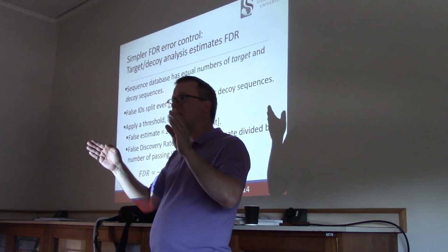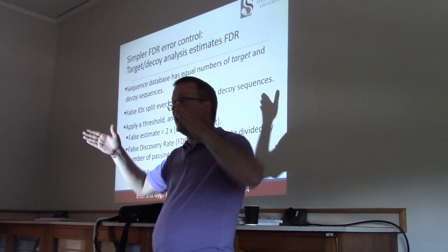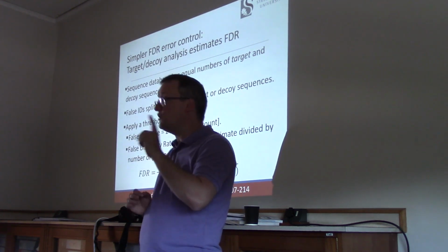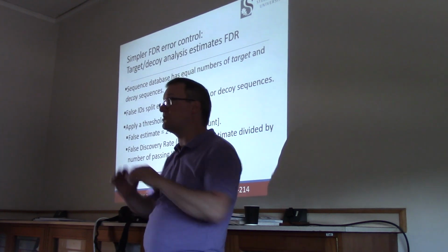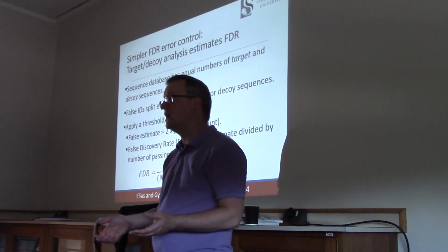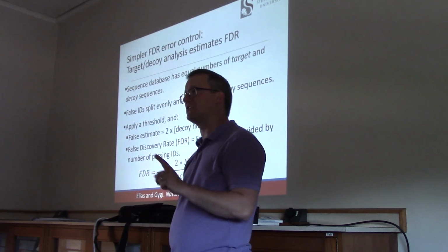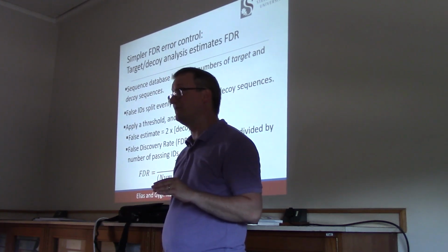I now include actin 2 ways in my database search, in its normal orientation, and then I reverse the series of letters from C-terminus to N-terminus and stick it in there. Furthermore, I'm going to mark that as a decoy protein. So maybe I started with 100,000 protein sequences from human in my database, and now I have 200,000 sequences in my database, but half of them have been marked as bogus proteins. This is not real, it doesn't exist in nature.